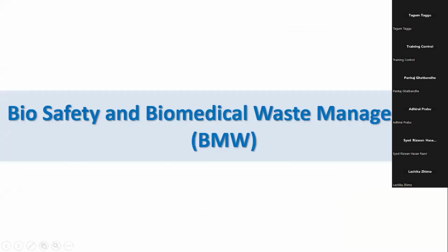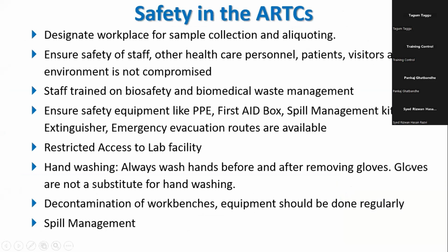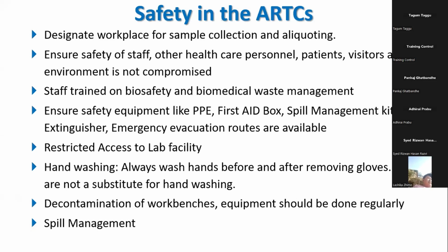Biosafety and biomedical waste management. Every ART center has a designated workspace for sample collection and processing. Ensure safety of staff and healthcare providers. You also have to ensure the safety of the staff handling your biomedical waste. Those people are usually unaware of the samples and the impact they can have on their health. So ensure you train your cleaning staff and housekeeping staff on how to dispose of the biomedical waste and how to transport it.